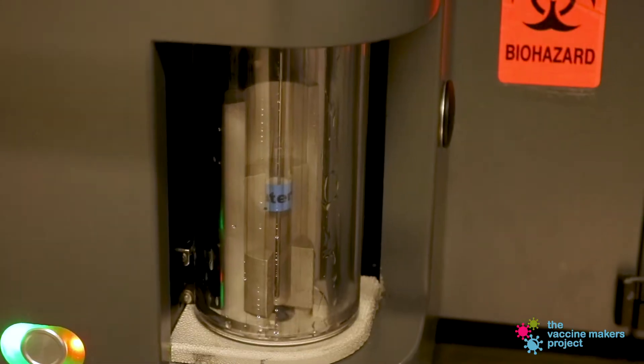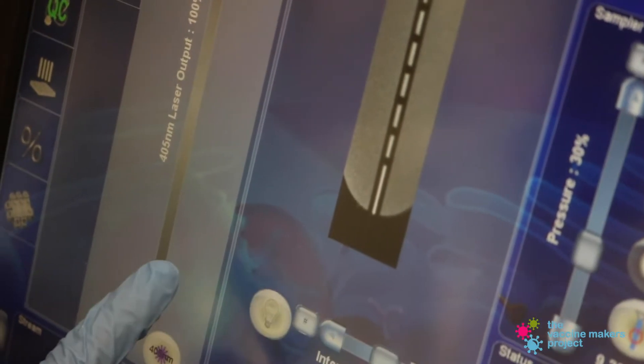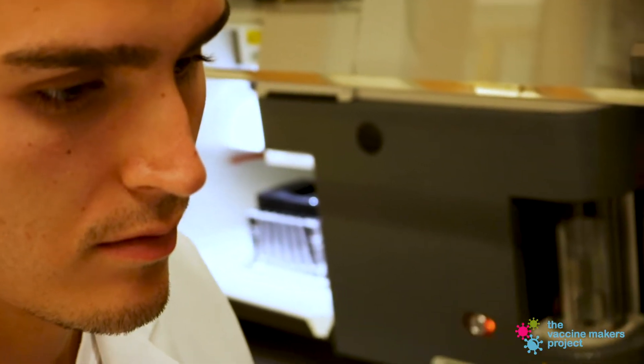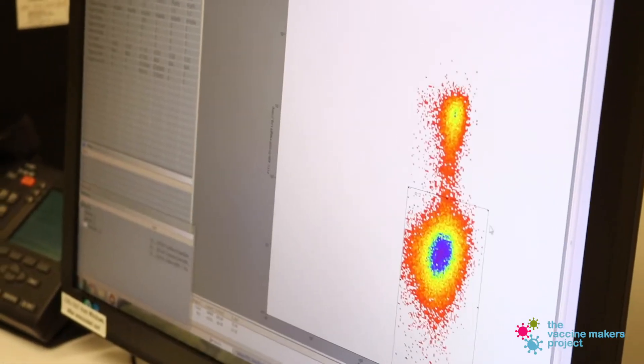The way flow cytometry works depends on the instrumentation. Analyzers are more for analysis to see how the experimentation worked or which cells are reacting to whatever treatment you've done to them.